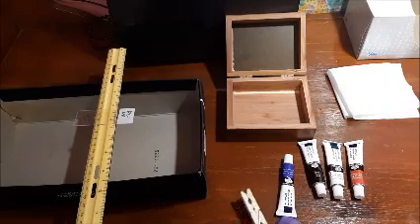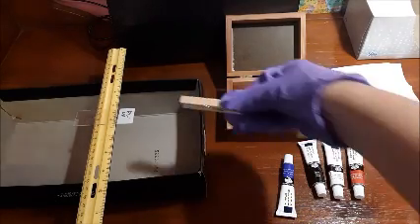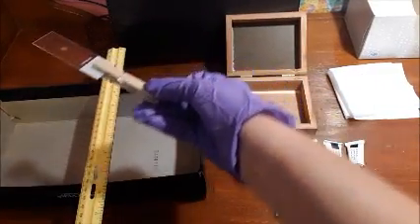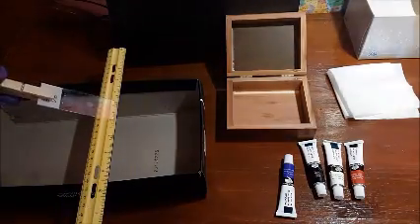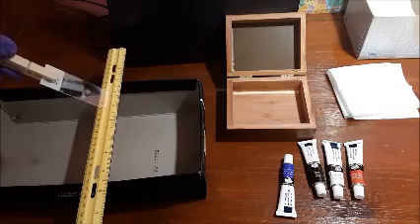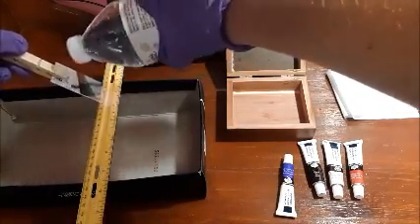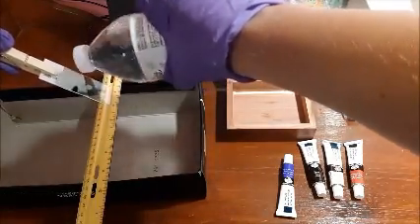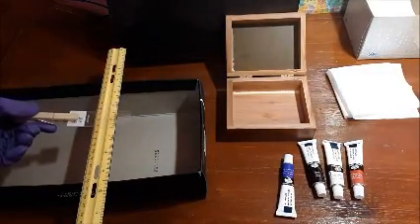Now what you're going to do after your slide has sat for 1 minute is you're going to take your slide clip, pick up the slide, and you're going to rinse it off in a gentle stream of water. Make sure to tip the slide downwards over the stain tray and just gently rinse the slide with water to get that excess crystal violet stain off. Then put it back down.